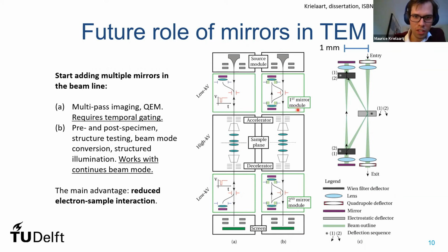So a bit more detail of this module here. You can see it has a bit more of the optical details available. And most interesting to note here is this scale. It's just 1 millimeter. We're really into using miniature electron optics to build all these things. And one of the main advantages, we believe, is that by having these two axes close to each other, you can keep the deflection angles very close, and that will help you tremendously in keeping deflection distortions to a minimum.